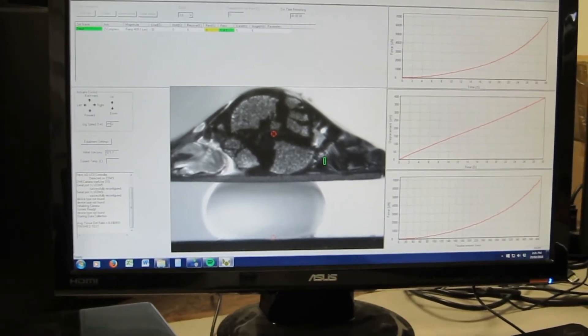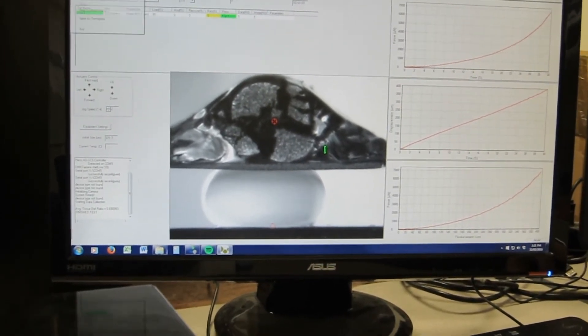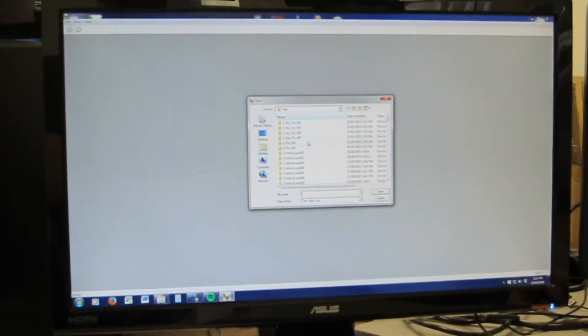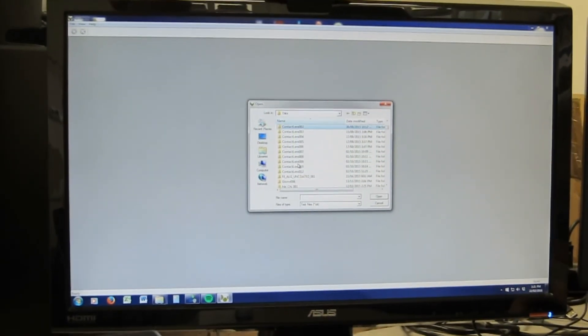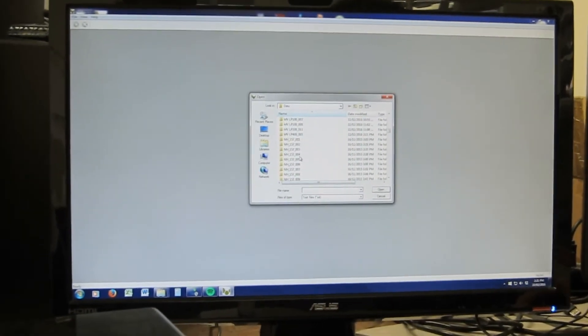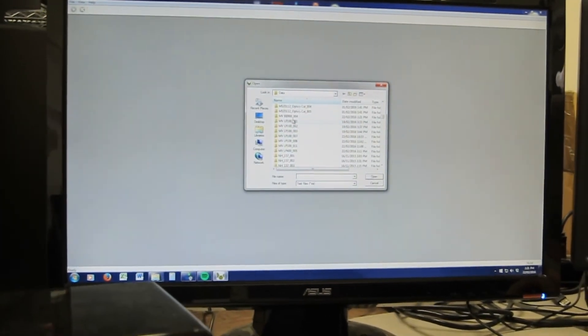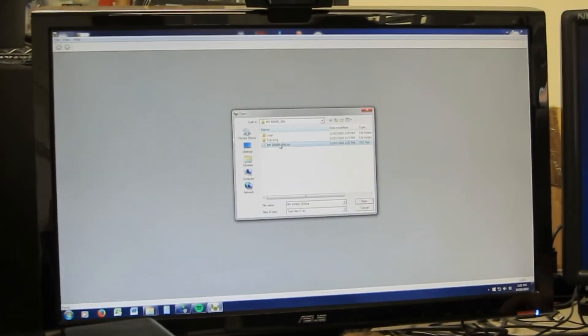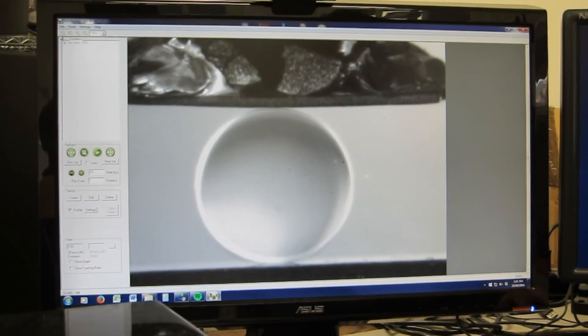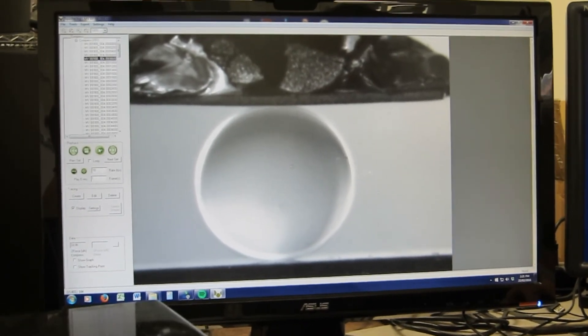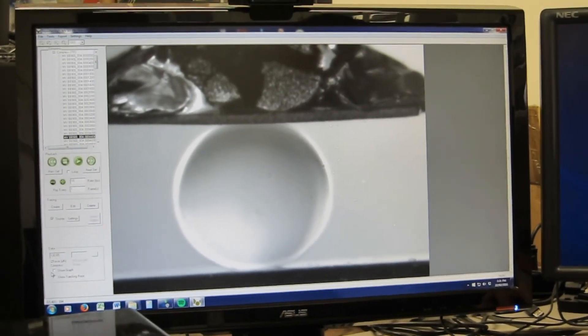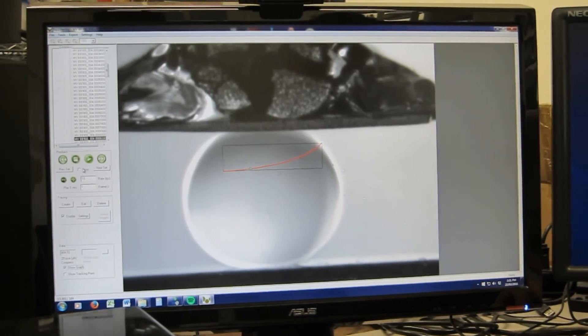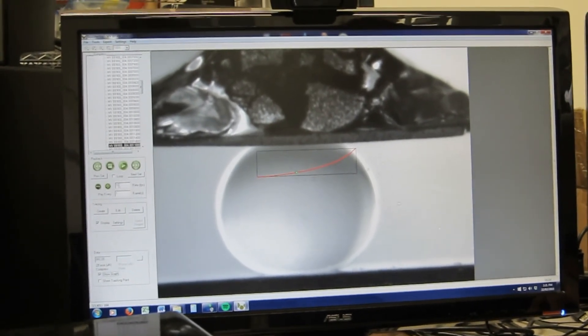And that's the end of the test and the software then allows me to go in and review this test. If I can find it here. I think it's this one here and I can then do a playback and start to look at the forces in real time as I maybe speed that up a bit.